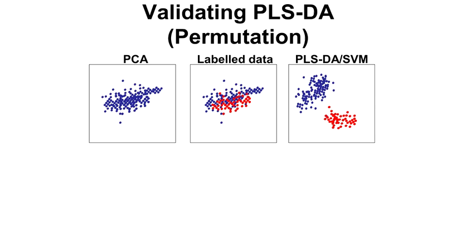So we run our PLSDA, and now it's rotated things very nicely. Perhaps because we were only plotting in 2 dimensions, if we plotted in 3, we might have seen a better separation. So we've run the PLSDA, it's rotated things, it's modified those principal components, and now you can see a really obvious separation. Okay, is this real? Have we given it too much information? Is it overtrained, or is it just essentially an artifact?